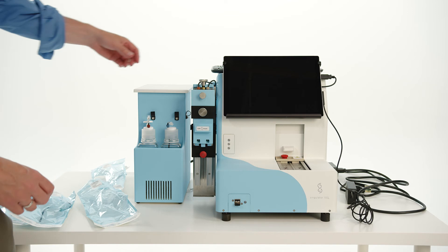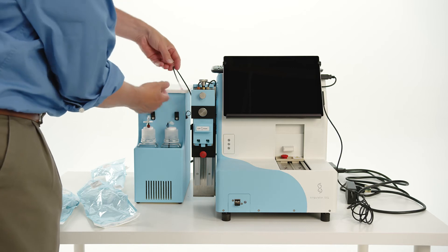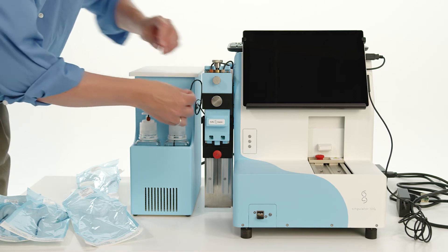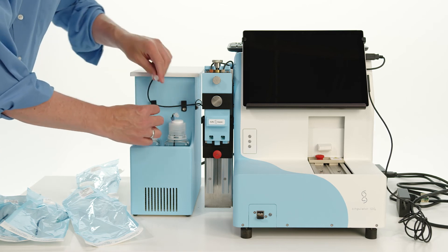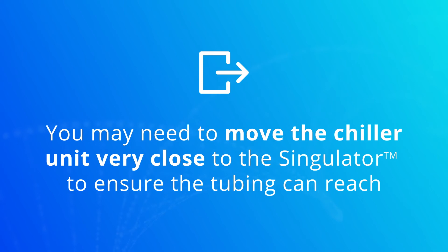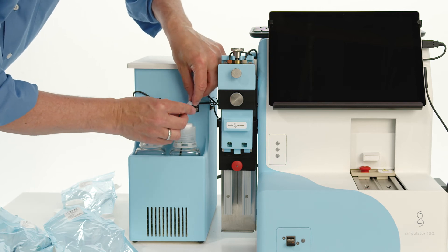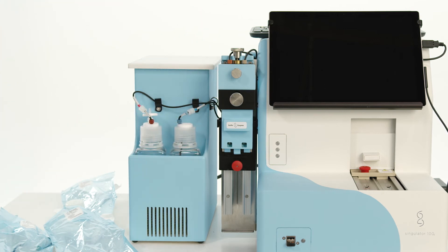Between the reagent chiller and the Singulator is the single-shot mechanism for loading enzyme and buffer reagents for cell isolations. Behind the single-shot mechanism, there are four pieces of black tubing secured with tape to the side of the Singulator. Remove the tape and identify the tubing with a red lure lock connector. Feed the connector through the black retainer loop on the side of the chiller unit, then through the two retainer loops on the front of the chiller unit, and finally connect it to the matching lure lock connector from the waste bottle. You may need to move the chiller unit very close to the Singulator to ensure the tubing can reach. Identify the tubing on the left side of the Singulator with a blue lure lock connector, feed this through the retainer loop on the right side of the chiller, and then connect to the matching blue lure lock connector on the water bottle.